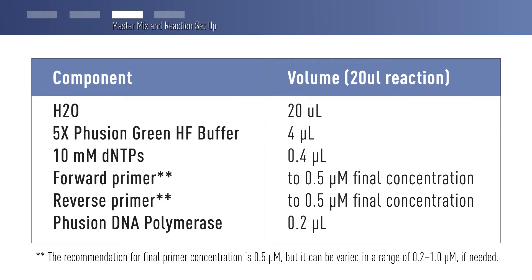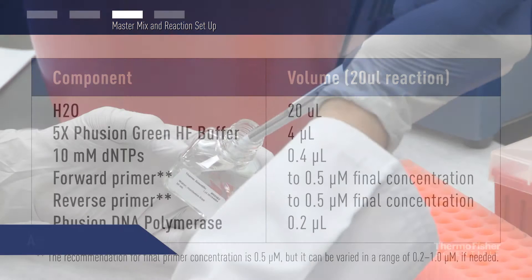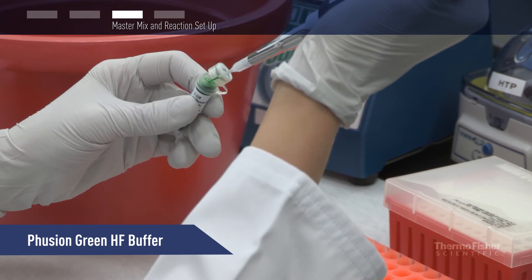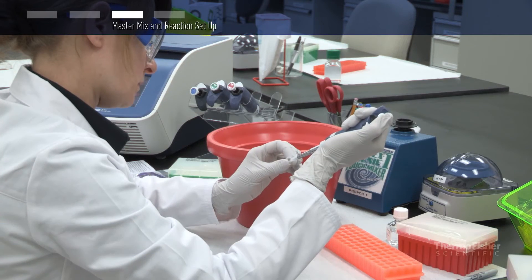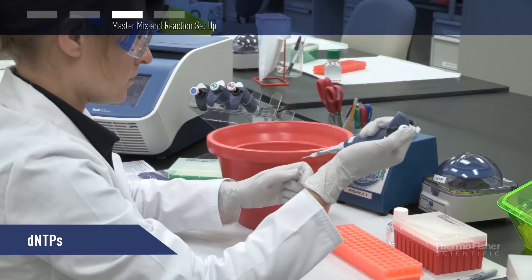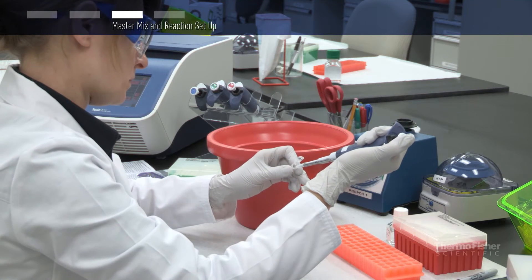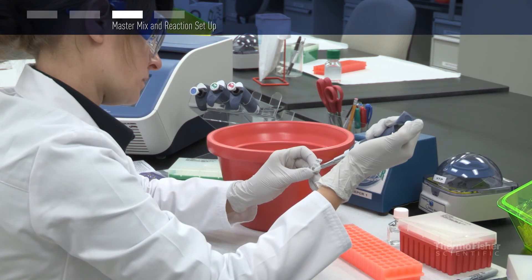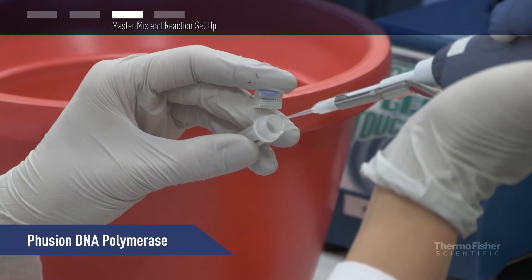Here are the reagents and volumes needed to prepare one 20 microliter Thermo Scientific Fusion Green PCR reaction. Add the water, Fusion Green buffer, dNTPs, primers, and Fusion DNA polymerase in that order.